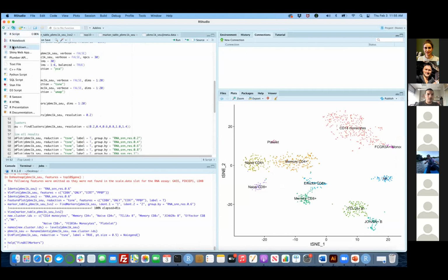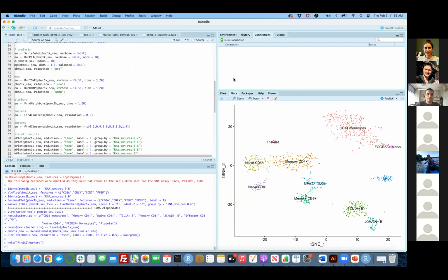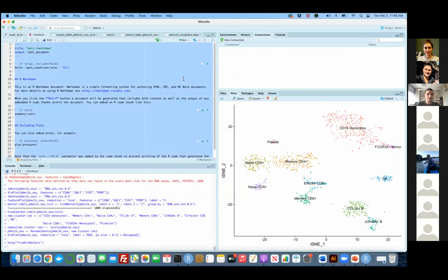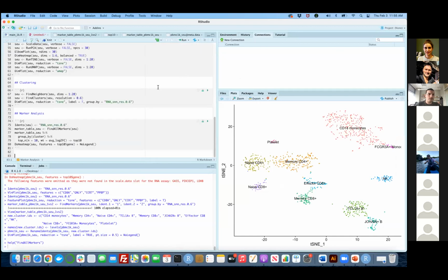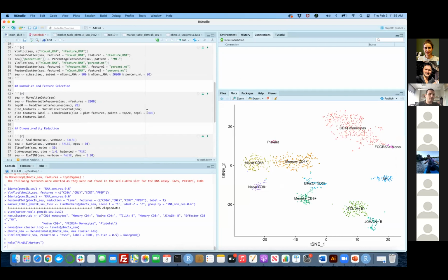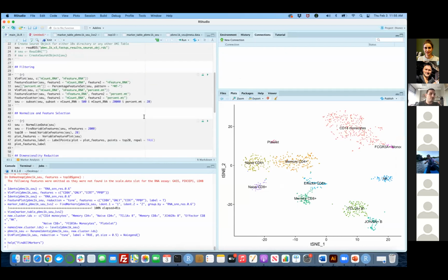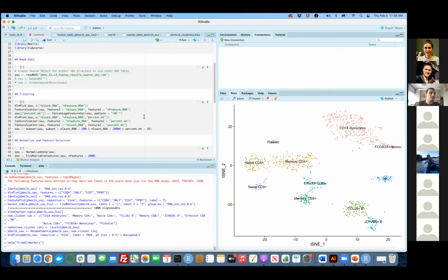and create a new R Markdown file. Let's give it the name main R Markdown. Delete everything and copy. So basically it follows all the steps that we have taken, right? It just used all the parameters that we have. Now you can just run them or change them. What it's actually doing is creating some kind of reproducibility, right?